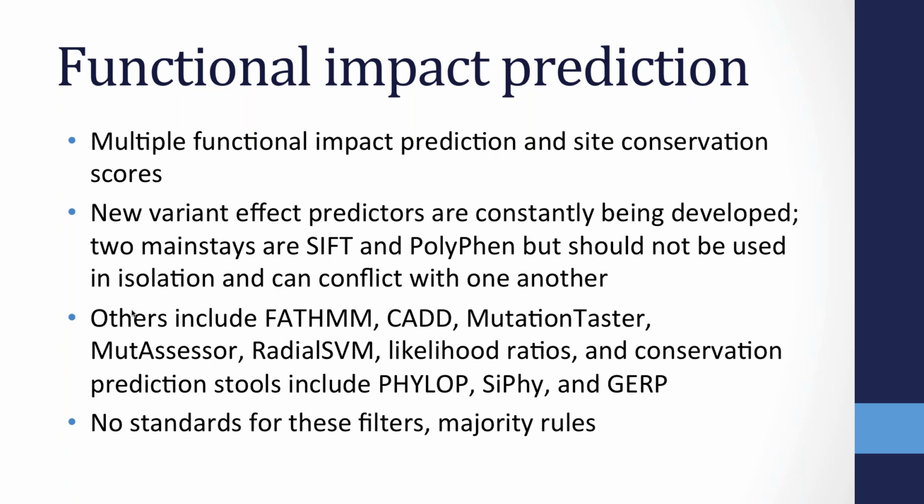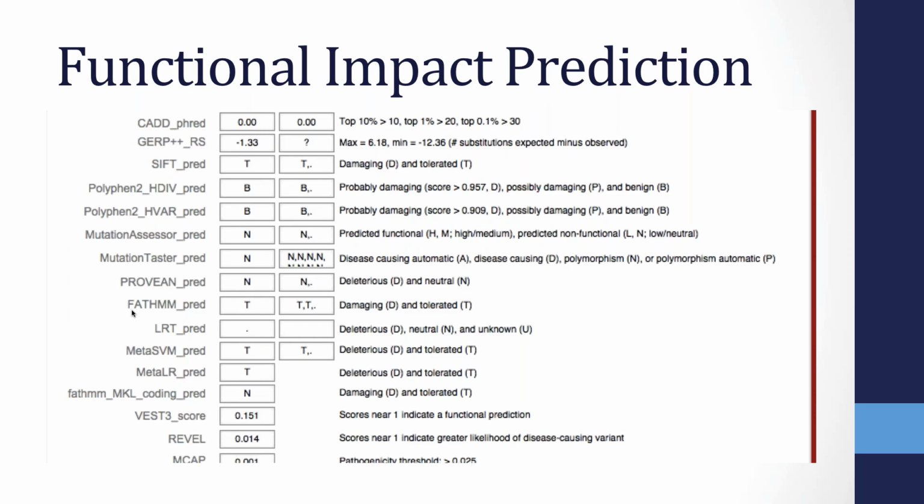So, considerations in these are basically what functional class the variant belongs to. Is it a truncating or splicing variant? Because that could potentially have a high impact. There are sometimes false positives due to sequencing error and selection constraints. And then the question of how tolerant is this gene to loss of function, and how frequently is it conserved as such in other species as well.